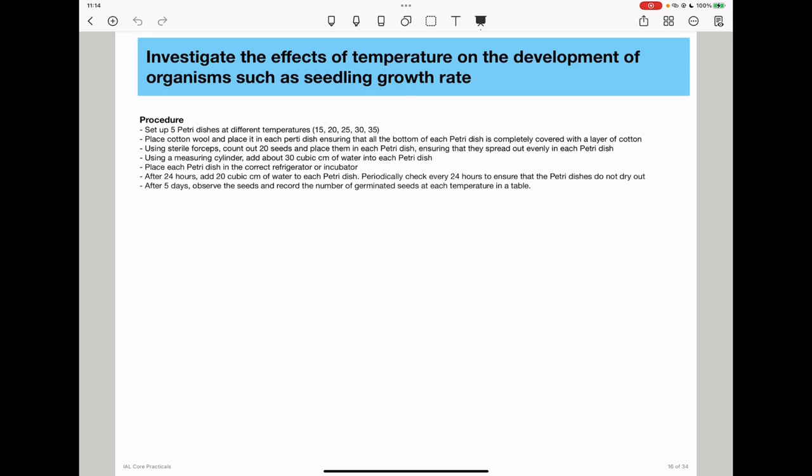The next part investigates the effect of temperature on the development of organisms such as seedling growth rate. Again, temperature is the independent variable, so we set up experiments at five different temperatures. We fold cotton wool and place it into each petri dish, ensuring the entire bottom is covered with a layer of cotton. We use forceps to count 20 seeds and place them in each petri dish, ensuring they are spread out. Then we use a measuring cylinder to add about 30 centimeters cubed of water into each petri dish.